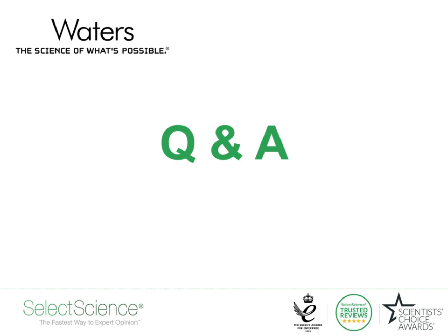Yeah, that's a good question. And it's back to the idea of this being a model rather than human skin. So we need to understand it does behave slightly differently to human skin, and in this case it's particularly for hydrophobic molecules where the rate of penetration is much higher than normal human skin. But you just need to understand these properties of the model to make it useful.